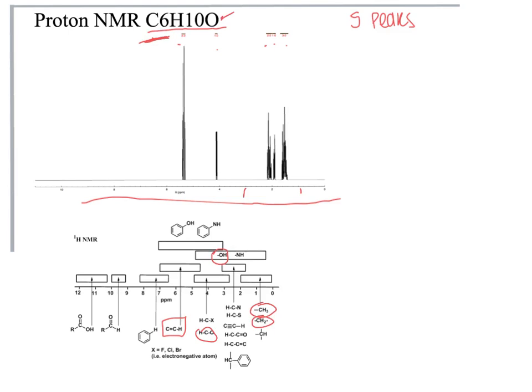According to this information, we can develop a ring based on 6 carbons, definitely with the presence of oxygen, so an alcohol. Using one of our hydrogens, we still have 9 left.